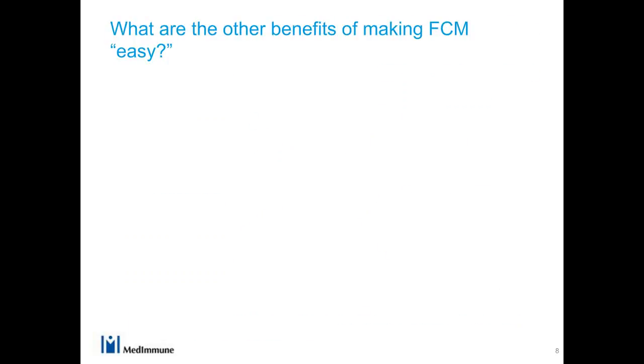So what are the other benefits of making flow cytometry easy? Really, to transform the science, we believe that we need new methods to deliver new medicine. Flow cytometry has been a critical capability for our manufacturing and drug development efforts, highlighted by our use of monoclonal antibodies. Our parent company's development of small molecules has been what we have traditionally used to call medicine. However, cell therapy is a new method of treatment that offers potentially curative therapies.